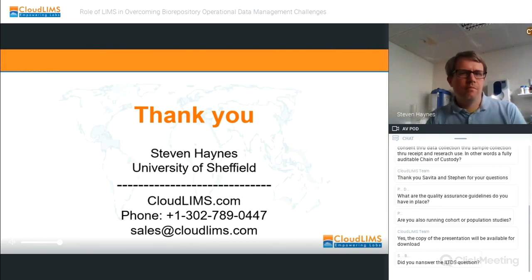Thank you. So we have another question on ILTDS, which is asked by Stephen. He asked whether you have an ILTDS for all samples from consent through data collection through receipt and research use? In other words, do you have a fully auditable chain of custody?